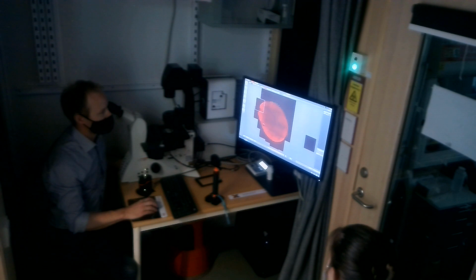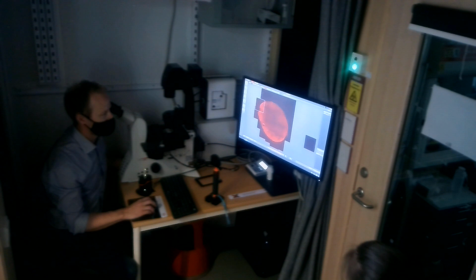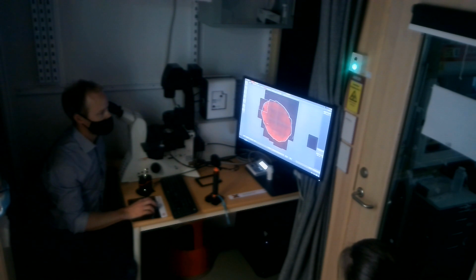Say that I want to image this whole tissue. We have one region of interest tool that we haven't used yet. It's a little bit of a hit and miss. It can work with tissue especially, and that's this magic wand. So the magic wand, you can go in and we can just click somewhere. We have to find somewhere that is good. I've tried there. It will automatically select my tissue here.